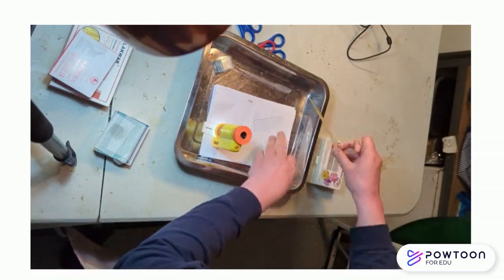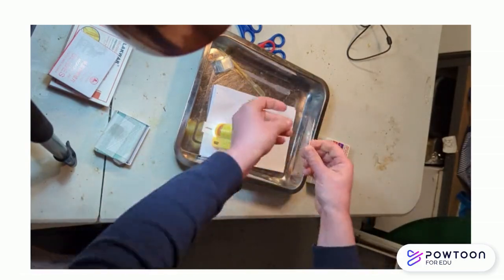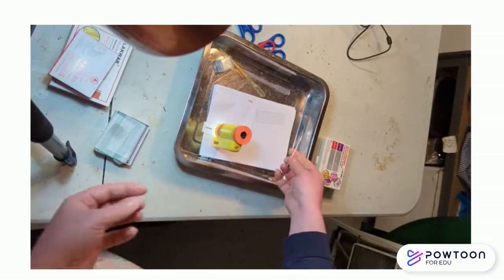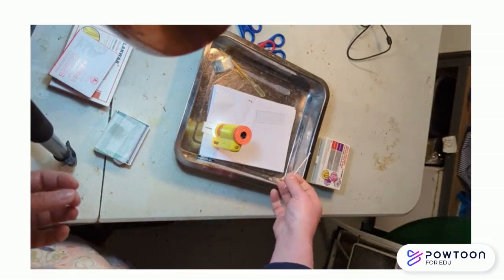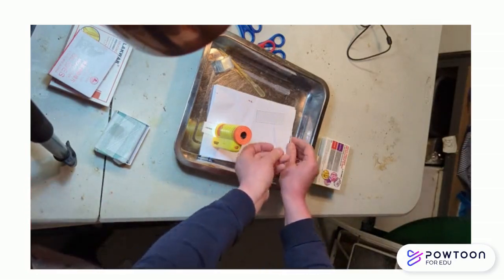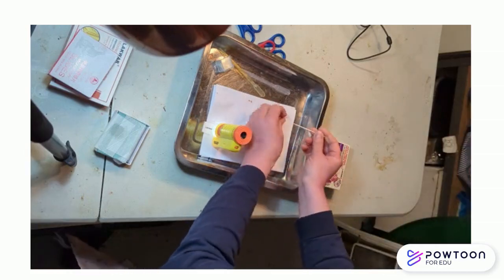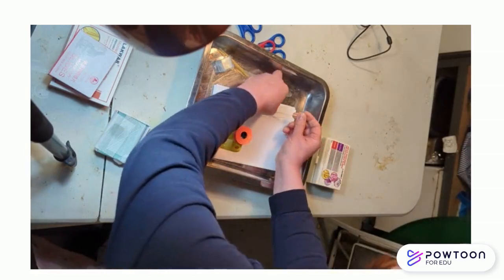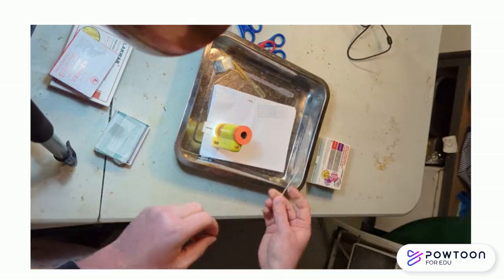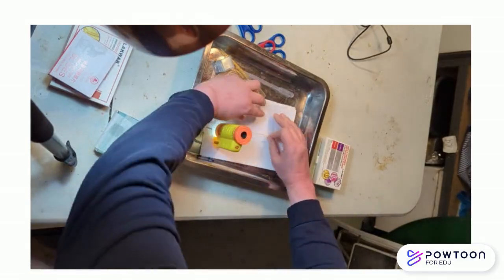You have moved with the pipette, whatever, actually you have moved with something, whatever sample you're checking. In this case, for example, it should be a section of onion peel. So the onion peel stain is here. Now you want to cover it, nice and gentle, nice and gentle. Now you've got the cover on top, and you must make sure that there is no air bubble and there's no dirt.